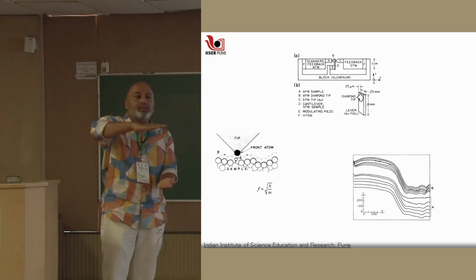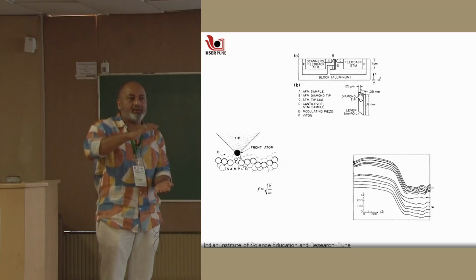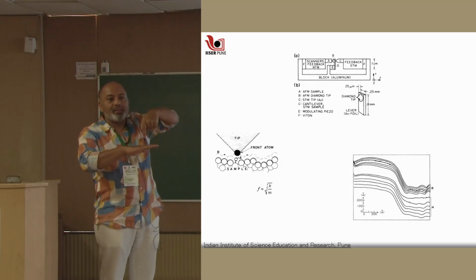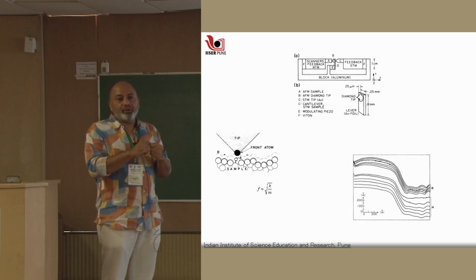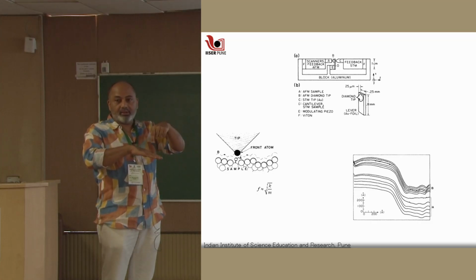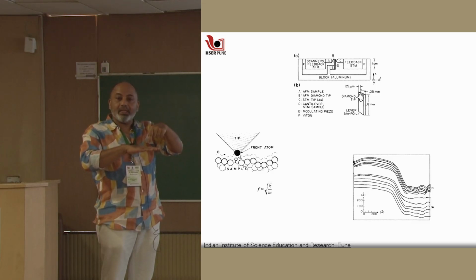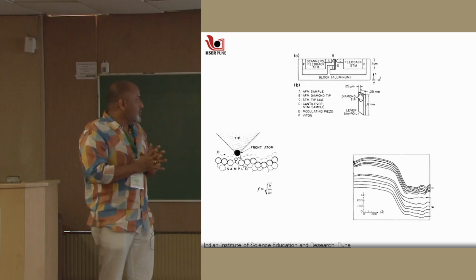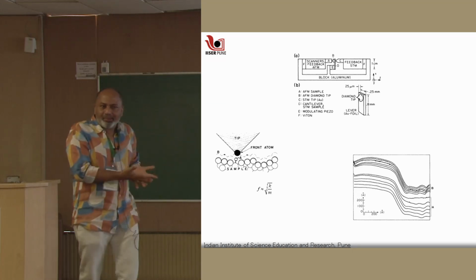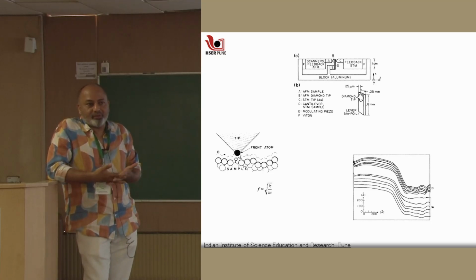And so, how do you measure that bending? How does one see how much it bent down by? What you do, you place another tip, which is an STM, on the back of the cantilever, and we know that if the distance to the surface that is bending changes, the current drops rapidly. So, the tunneling itself is used as a method to find out how much the cantilever bent by. Okay. So, how did they think about this? Why did they think about this? What was the reason for the invention of AFM?